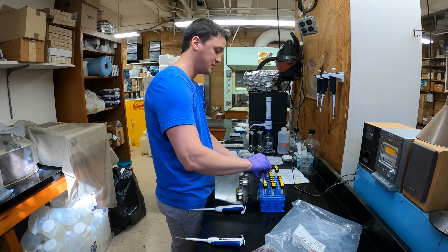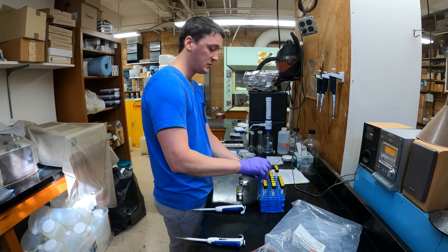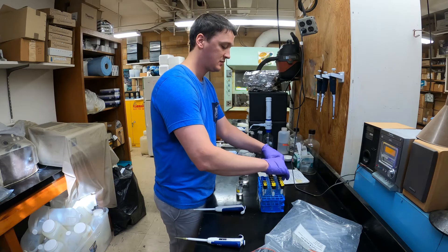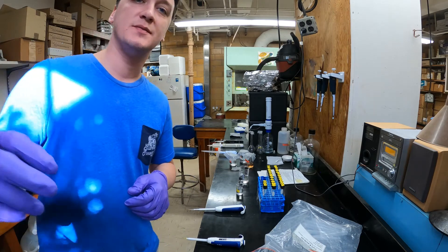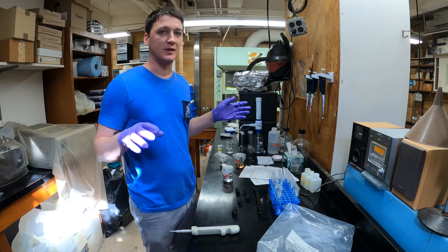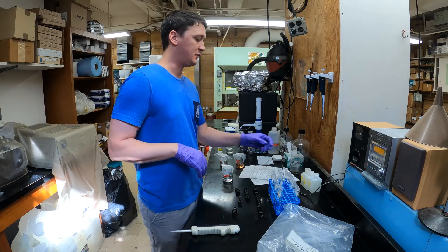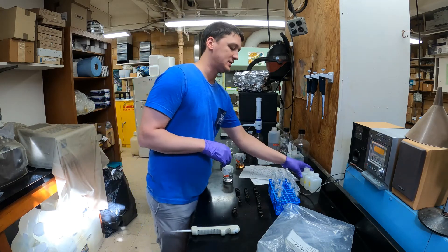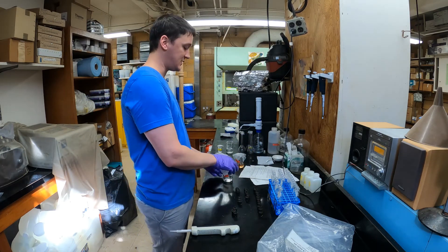I'll cap these and then finish the rest of the standards in the curve, and then we'll go through and add all the reagents. I've created a series of test tubes that cover a range of concentrations we expect for our samples, and I've also gone ahead and pipetted 10 mils of our Willow Lake samples in triplicate test tubes — three of each. Now I'm going to start to add the reagents.